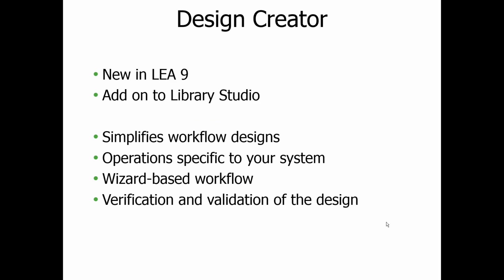LEA itself has gone through a number of iterations in its history. What we're introducing today is LEA 9. The key functionality or difference in LEA 9 is the addition of a program called Design Creator. So Design Creator is not a new program. It is an application, an add-in, or a plug-in, you choose the term, to Library Studio. So the intent behind this is really to simplify the creation of workflows. There is a lot of complexity in terms of all the things you can do with an automation system.